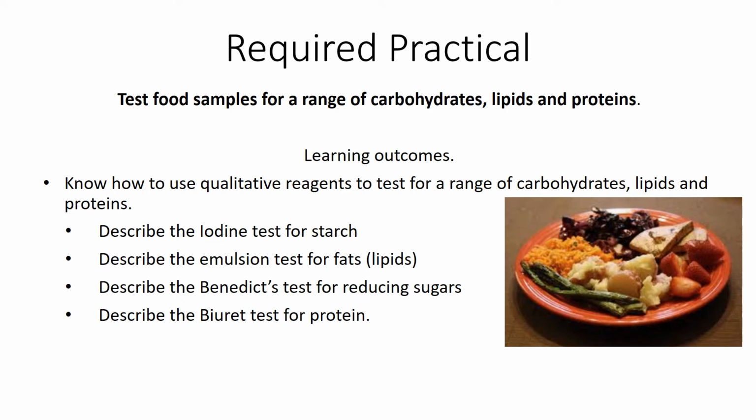So today we're looking at the required practical for testing food samples, and you need to be able to explain 4 different food tests. Now these food tests you would have done in year 7 and again in year 9 and possibly in year 10. They're not very exciting, however they do produce some pretty colours and they're quite messy, so they're quite good fun.